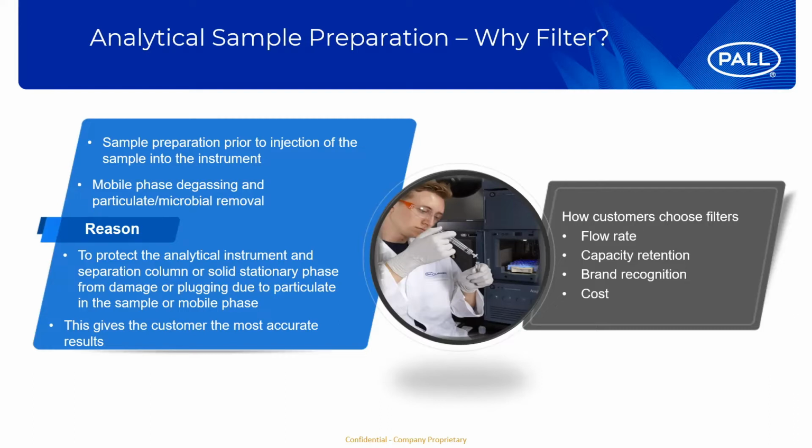Other solutions, buffers, or solvents are also run through these instruments, and those too need to be properly filtered to keep baseline steady and to keep consistency between runs. Failure to properly filter these can also result in contamination of microbes, which themselves can release biomolecules that will get read by certain instruments, making data interpretation difficult or impossible in some cases.